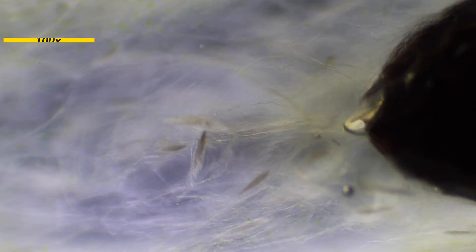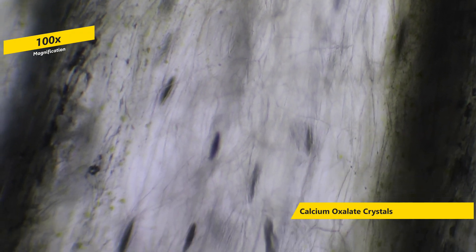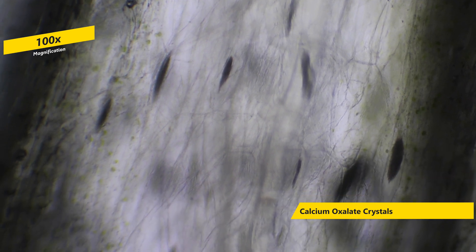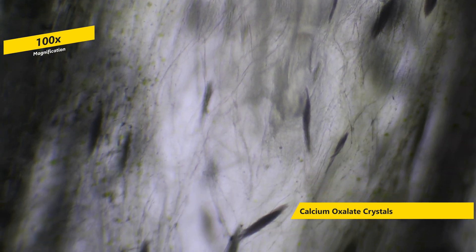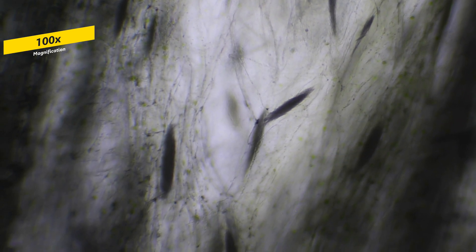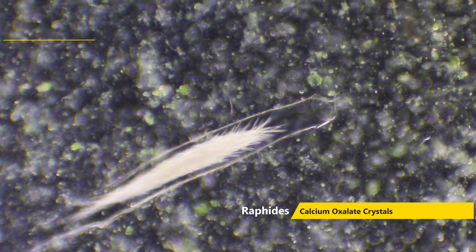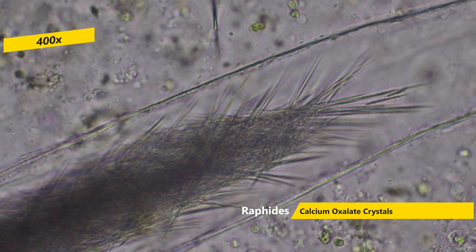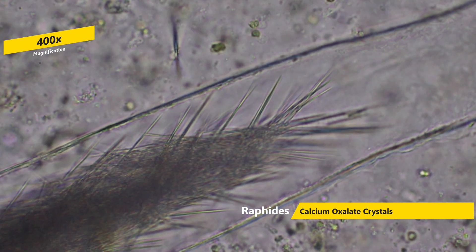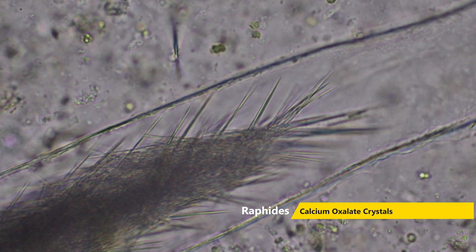We'll start off with the inside. One thing you'll immediately notice is not only the kiwi cells, which are the green portion, but also the presence of these white or dark spots, which are clusters of calcium oxalate crystals. These are one of the causes of your mouth pain. They are needle-sharp crystals called raphides. When a kiwi is eaten, these sharp crystals prick you and cause microtrauma to your mouth. They are considered to be a defense mechanism by the fruit against predators.